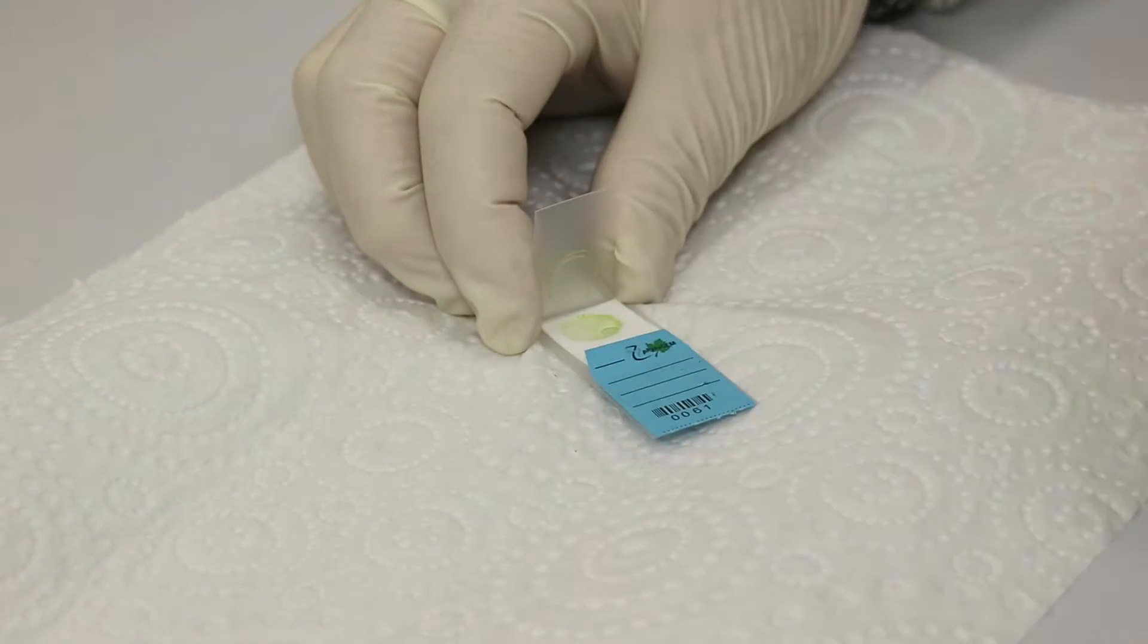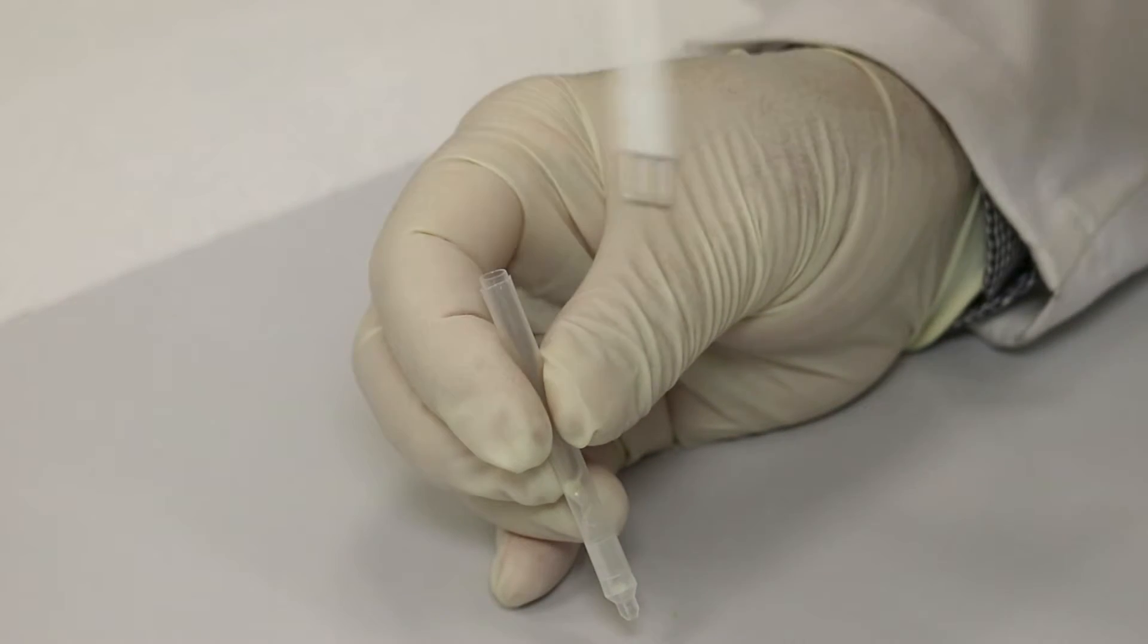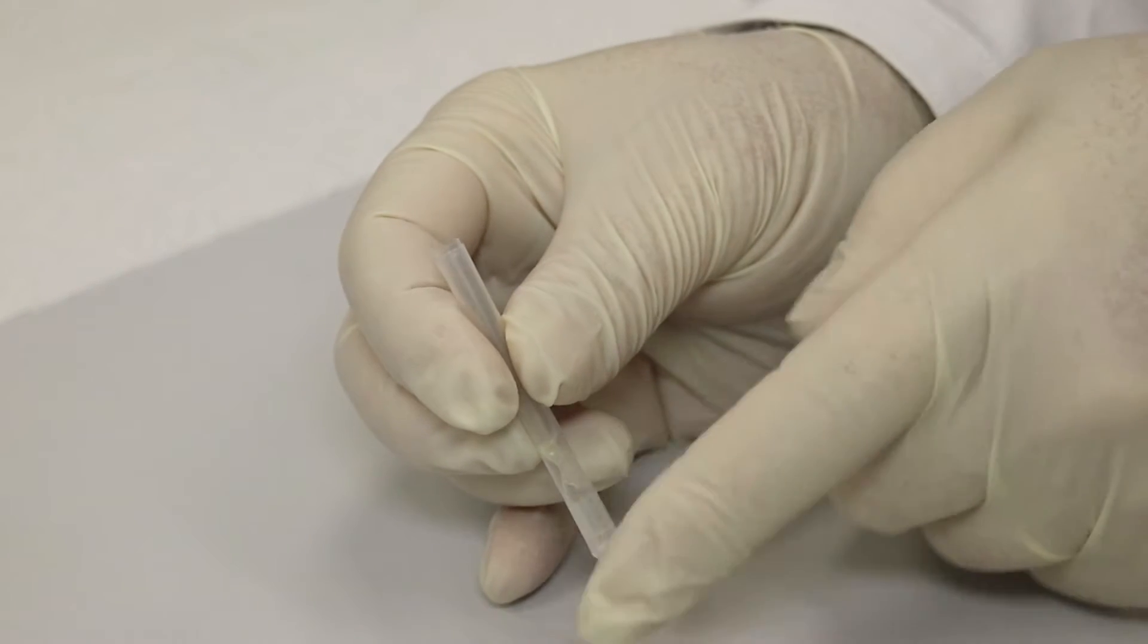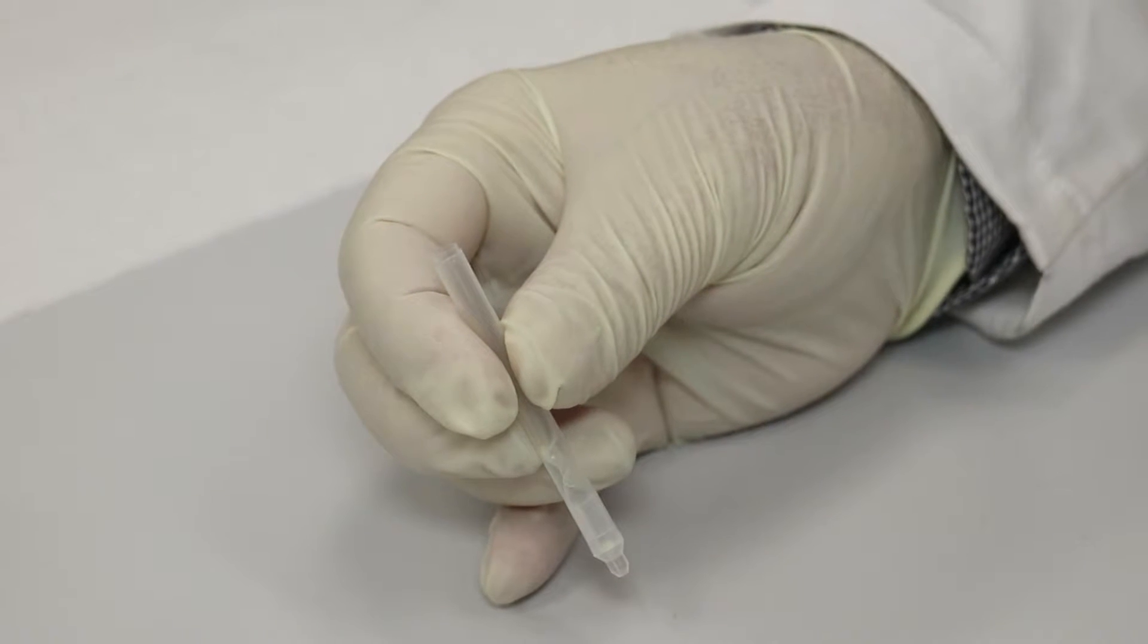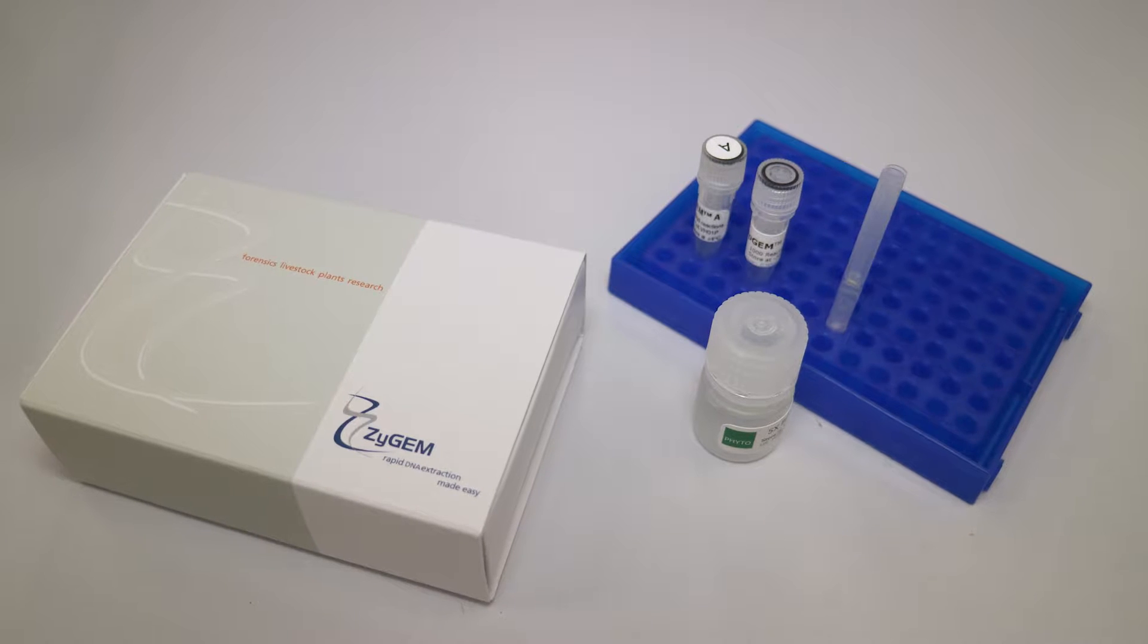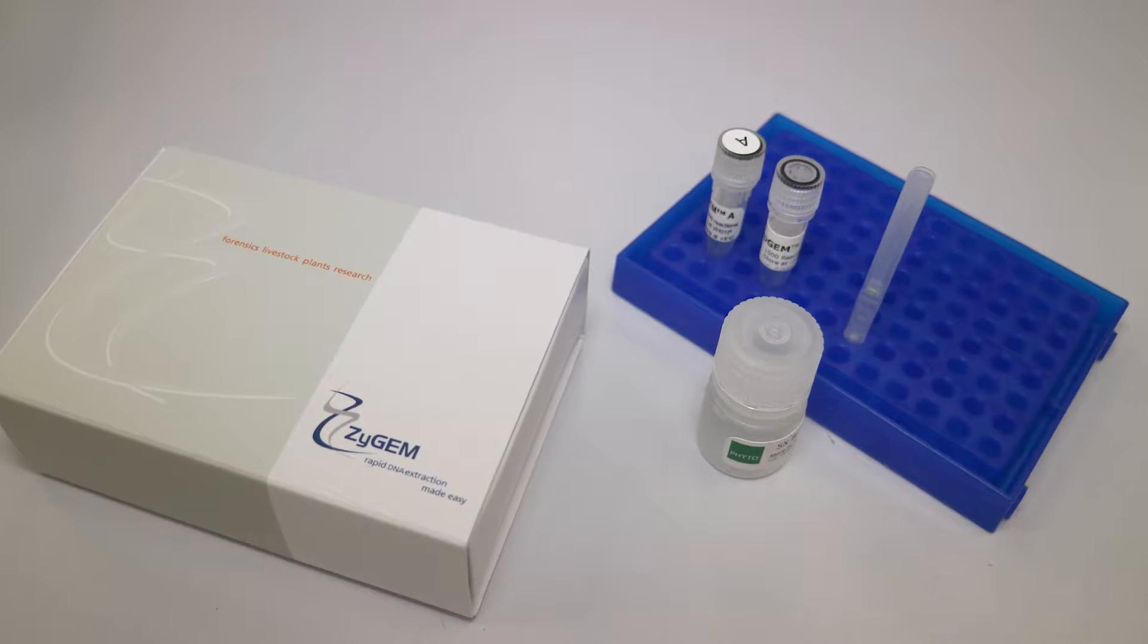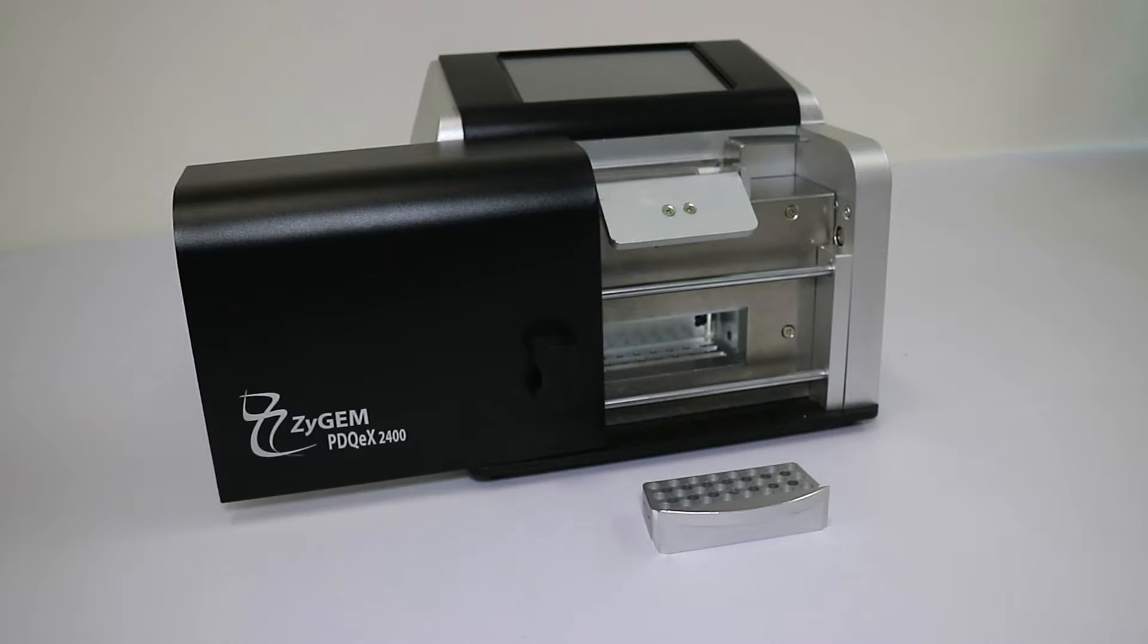Portions of the card are taken using the punches provided with the Phytogem kit. One or more punches are placed into the PDQX extractor tube. The Phytogem reagents are a unique mixture of glycosyl hydrolases and proteinases that rupture the cell walls, releasing the DNA and digesting nucleosomes and nucleases.